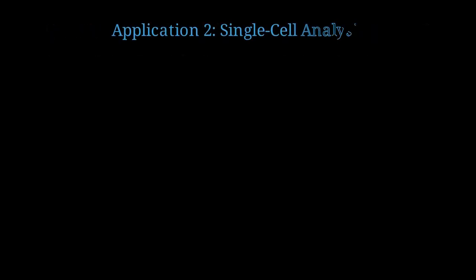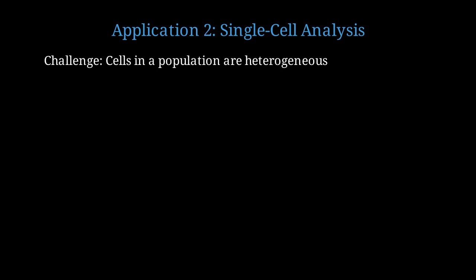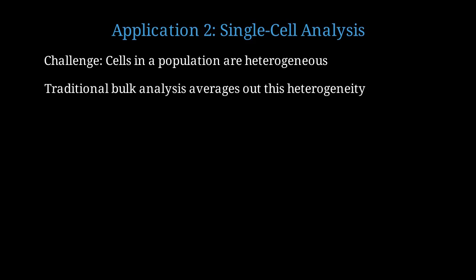Another powerful application is single-cell analysis. Let's explore how droplet microfluidics revolutionizes single-cell studies. The challenge in biology is that cells in a population are incredibly heterogeneous. Even genetically identical cells can behave very differently due to stochastic gene expression. Traditional bulk analyses, where you lyse millions of cells together, average out all this beautiful heterogeneity. You lose information about rare cell types and transient cellular states.